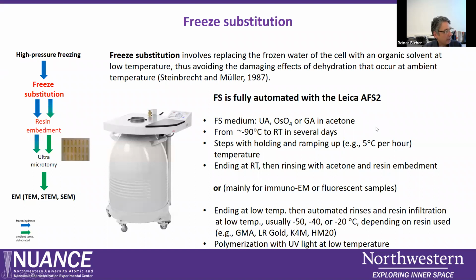After several days, the temperature is gradually ramped up until we are at room temperature, and then we can take the sample out, do some rinsing steps, and do the resin embedment procedure. So this is one way.